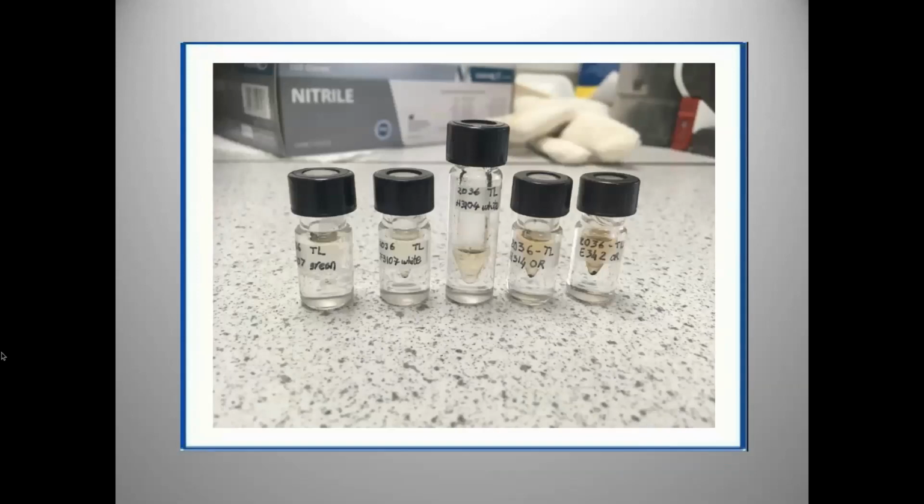The aims and objectives include to broaden the understanding of Sims' working techniques and materials, and thus add to the knowledge about the working habits of a prominent 20th century artist, to provide a concise record of the ingredients in selected popular commercial tempera tube paints, which may have been used by Sims on his works on paper, and to undertake scientific analysis on Sims' sketches and preparatory works on paper in order to search for the presence of tempera. The GCMS samples are shown in the current image.